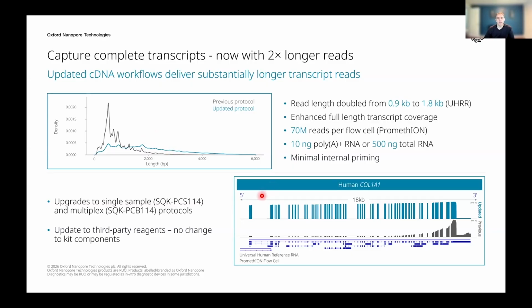In the lower right here, we have an example with COL1A1. It shows the practical effects of these improvements. So it's a really long transcript, about 18 KB, and the reads generated with the updated protocol here in blue. We can see we're getting much better coverage, especially towards the 5' end, than we did with our previous protocol.